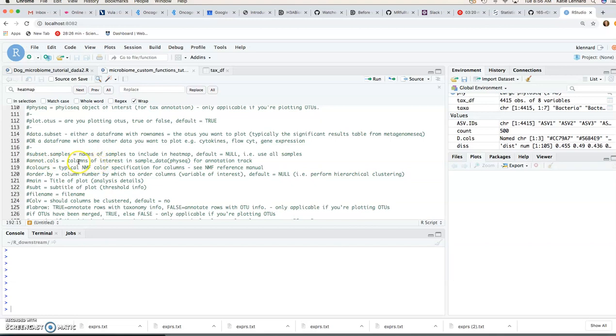And then for those annotated tracks you can choose specific colors. So certain color specification lists here and then you can also choose to either order our samples or perform hierarchical clustering.